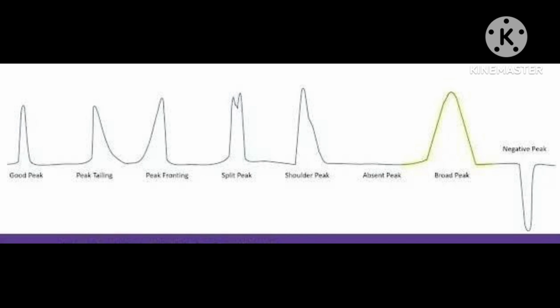In the last video I had discussed different types of HPLC peaks like good peak, peak tailing, peak fronting, split peak, shoulder peak, absent peak. In this video I will discuss broad peak and negative peak.